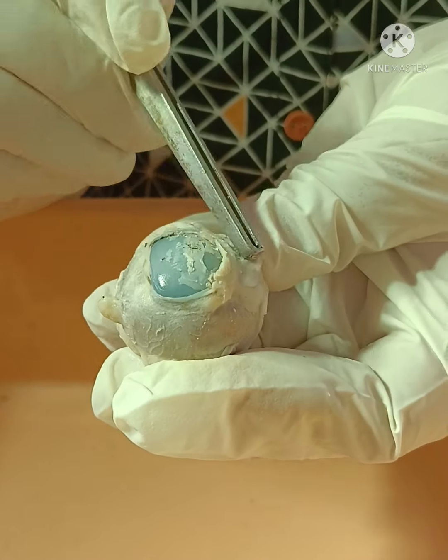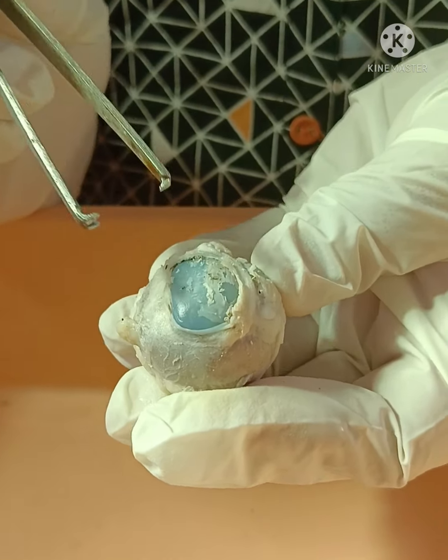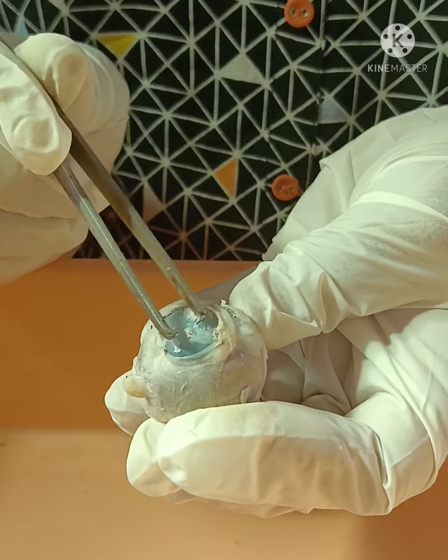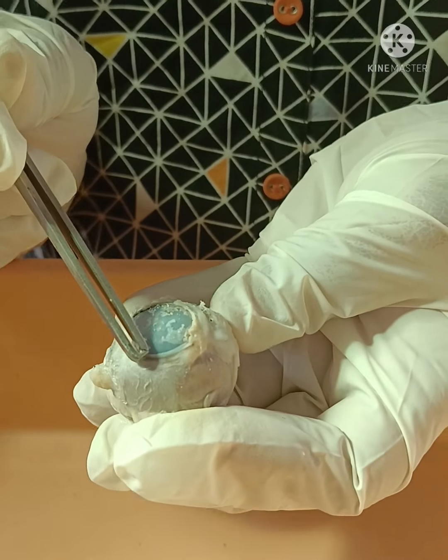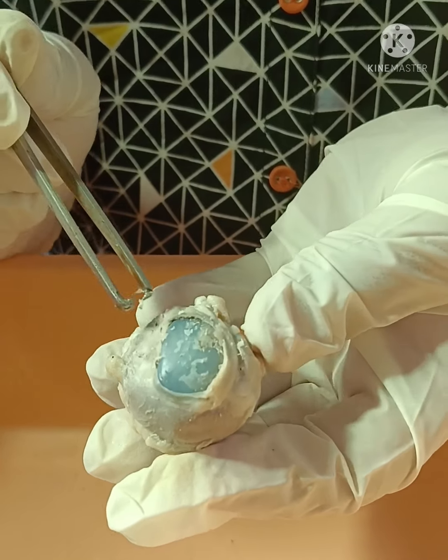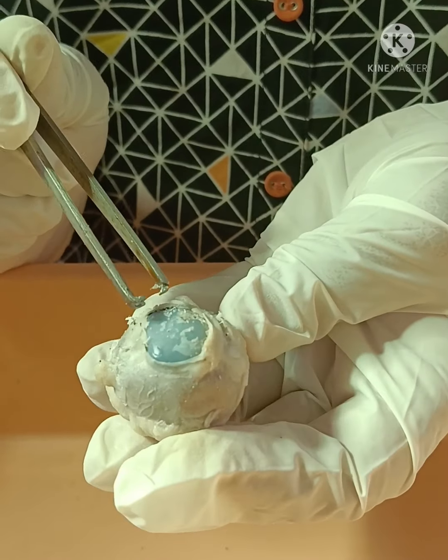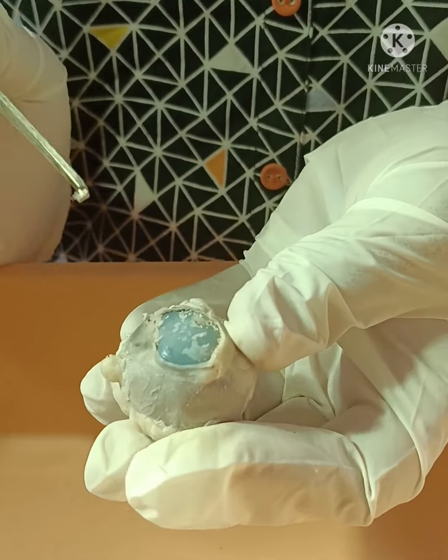Whereas the cornea is a very transparent, thin, avascular layer. This avascular layer is nourished from capillaries present at the sclerocorneal junction, which is known as the limbus, and from the aqueous humor and lacrimal fluid. So from these, nourishment takes place.